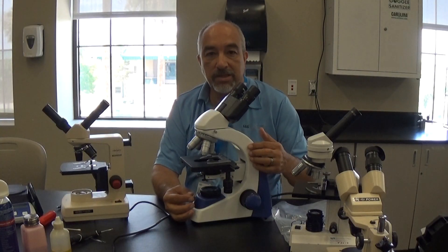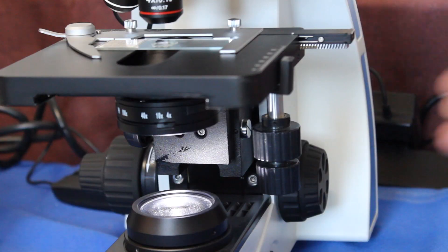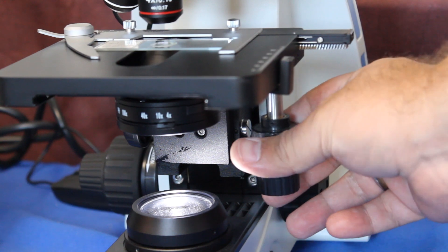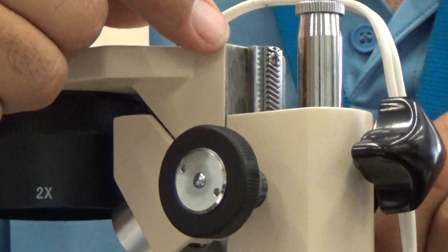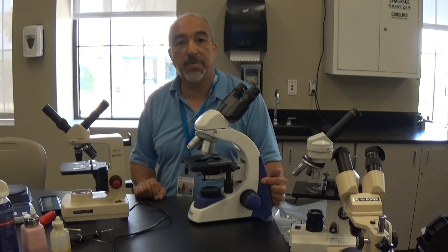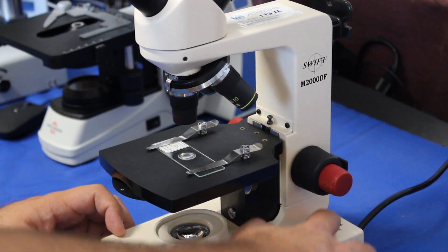We're going to clean the exterior surfaces of your microscopes. We're going to inspect, clean, and adjust mechanical stages as well. We're also going to adjust the internal rack and pinion system of your microscope. And we're going to inspect the illumination of the lighting system to make sure that it's working properly.